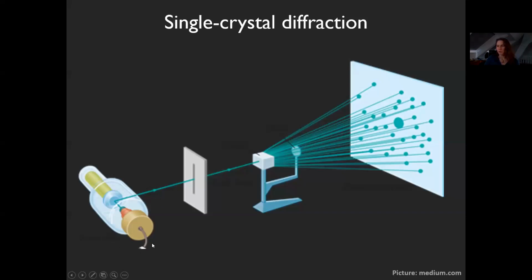So you can see here an X-ray experiment. The X-rays are emitted through a slit system onto the crystal, which is the cubic thing in the middle. And then the X-ray is diffracted by the crystal, which works as a grating and gives us spots. And from these spots, we can then calculate the structure of the molecules that make up the crystal. Of course, this requires a crystal. How do we get it?